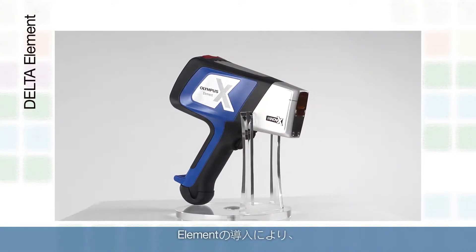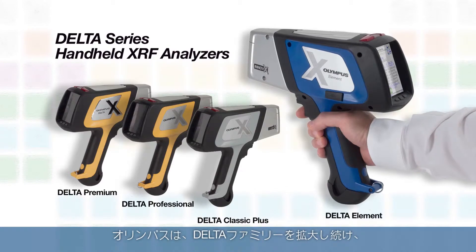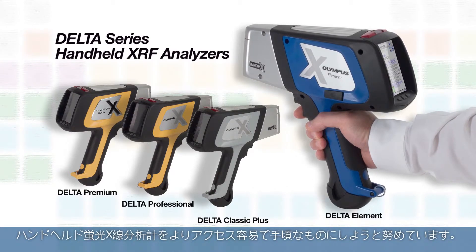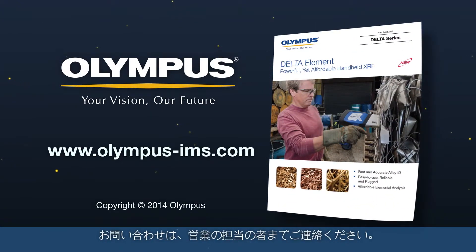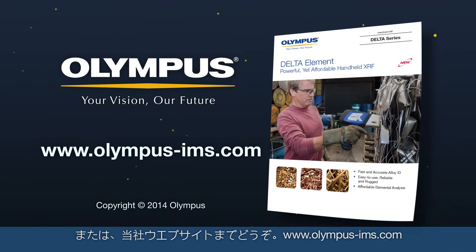With the introduction of the Element, Olympus continues to expand the Delta family to make handheld XRF more accessible and affordable. For more information, please contact your local representative or visit us online at www.olympus-ims.com.